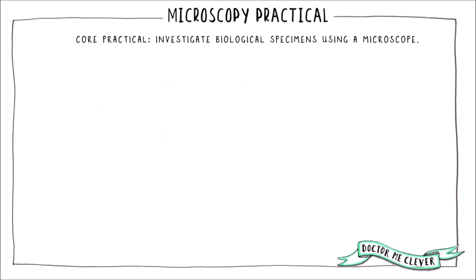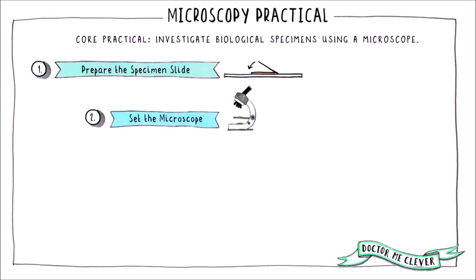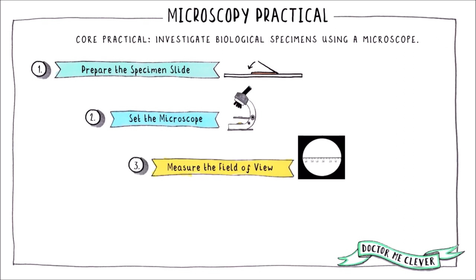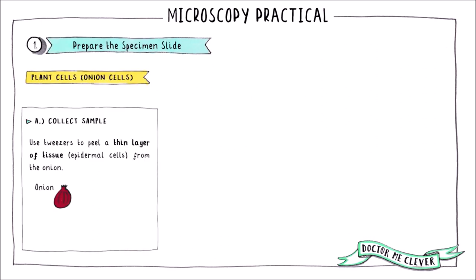The first core practical requires you to investigate biological specimens using a light microscope. By the end of this video, you will know how to prepare microscope slides for samples of plant and animal cells, how to set the microscope to generate a focused image of your sample, and how to measure the field of view and draw a scientific diagram.